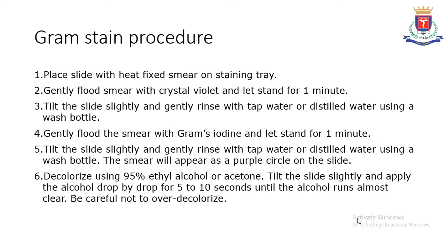Then you will gently flood the smear with crystal violet and let it stand for around 1 minute. Tilt the slide slightly and gently rinse them with tap water or distilled water using a wash bottle. Then gently flood the smear with gram iodine solution and let it stand for 1 minute.